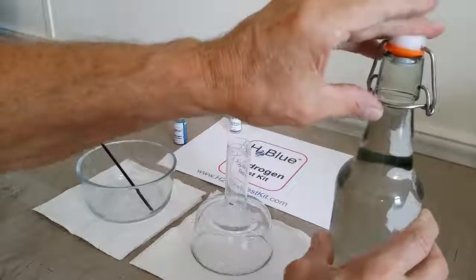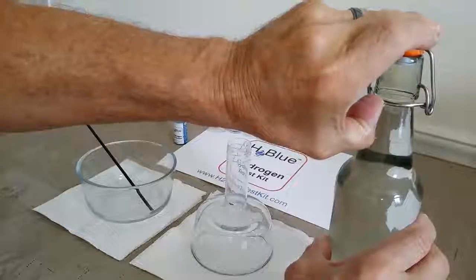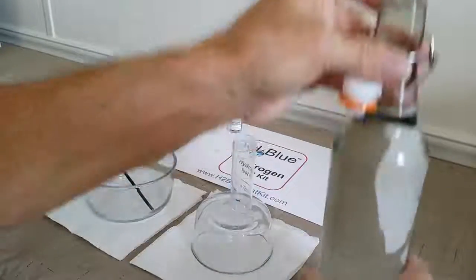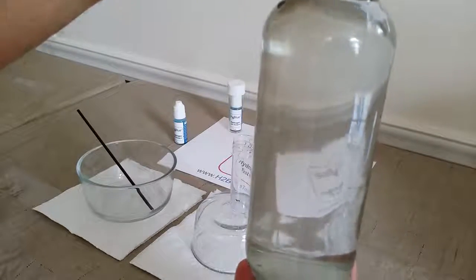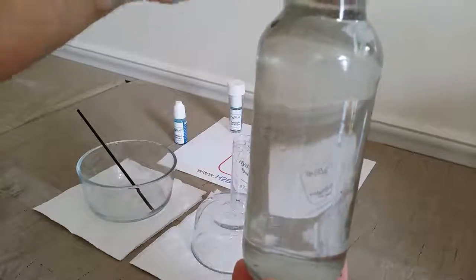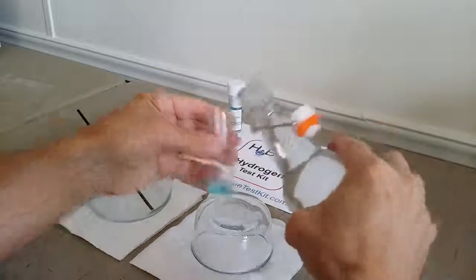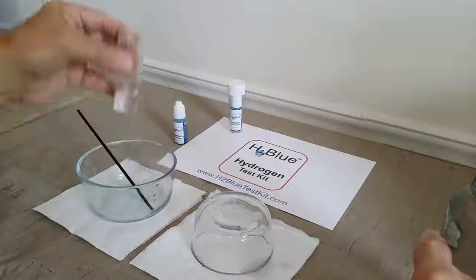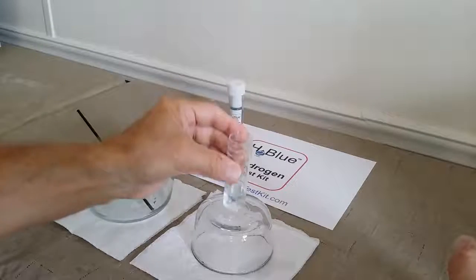And we don't want to waste a lot of time. We want to move quickly because hydrogen gas is escaping pretty rapidly. You've heard the pop there. If you look closely at the bottle, once you release the pressure, you'll see the hydrogen gas is starting to effervesce just like a champagne bottle. So we want to move rapidly here. I'll pour 6 milliliters in, and I want to get it as close as possible. That's got the meniscus right where I want it.